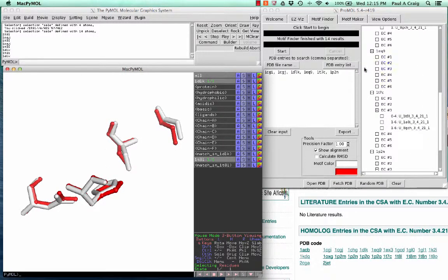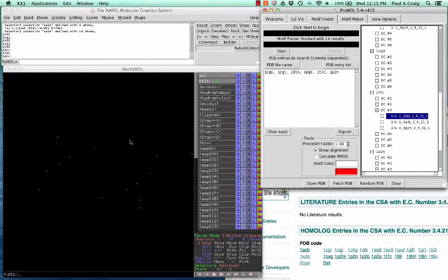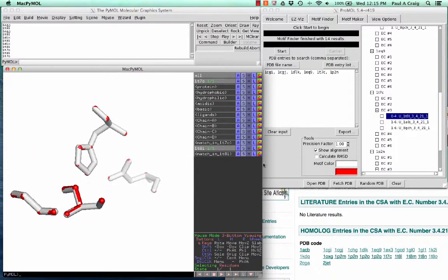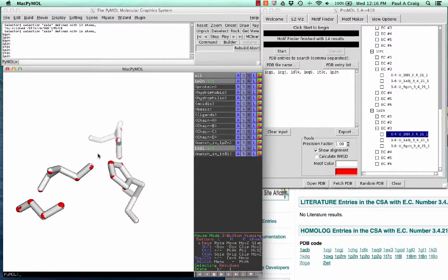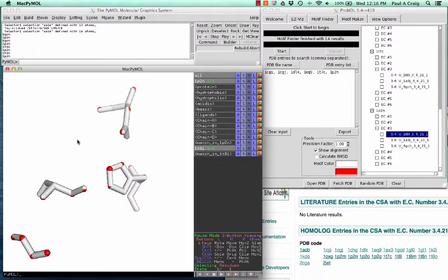1EQ9 didn't give any results. If we go to 1T7C, and look at the 1T8L results, we see that in fact it found all 4 residues again. And so the white once again is the motif, the red is the query. And the alignment for 1P2N again includes all 4 of the desired residues. And in fact, when we get a properly tuned motif, we can run lots and lots of structures against it. In the case of the serine proteases, the results are generally pretty good.